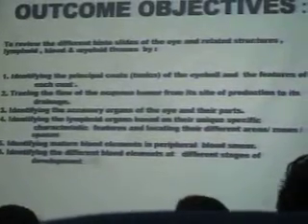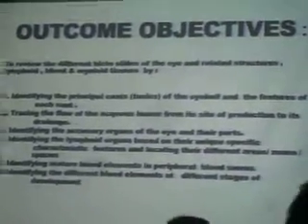Microslide projection will be of great help to you if only you're familiar with the slides that are assigned for you. Okay? If this is your first time to see the slides, unless you have a photographic memory, you'll not get much out of it. Okay?